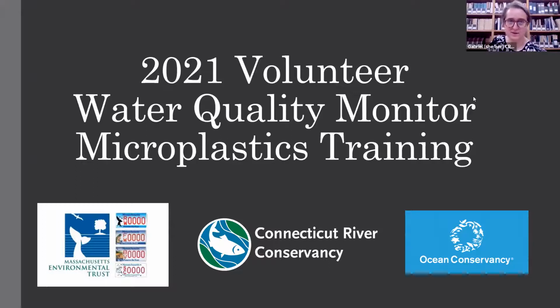You are at the 2021 Volunteer Water Quality Monitoring Microplastics training. So microplastics is one of our new parameters that we're testing. We also test under the kind of banner of water quality monitoring. We also test nutrients and bacteria, and we have our invasive species monitoring. And so microplastics is being added to the docket.